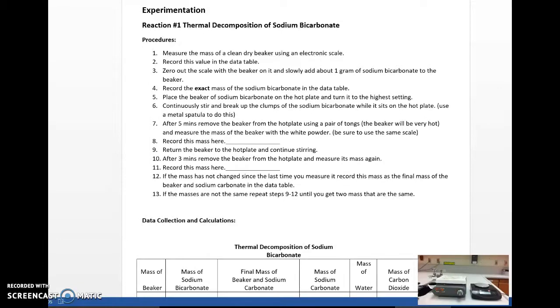Our first step is to measure the mass of a clean, dry beaker using an electronic scale. First, make sure that your scale is in grams. You don't want to make sure that it's not in ounces or something like that. Then I'm going to go ahead and put it on the scale. Obviously, record that mass in the data table as it says in number two.